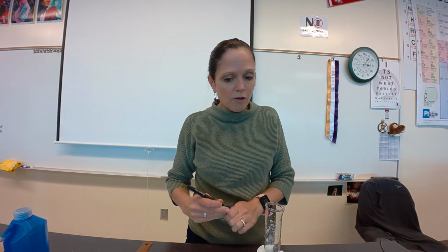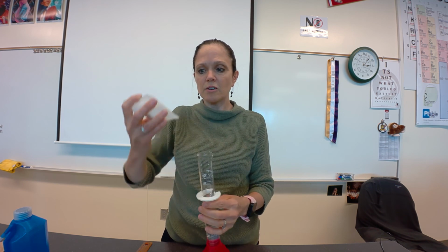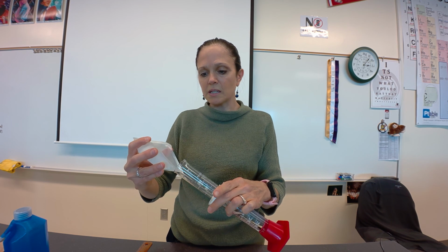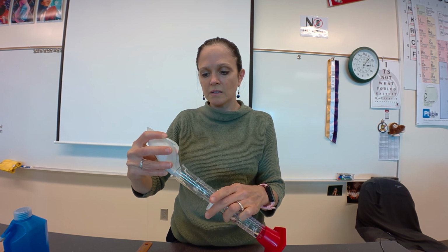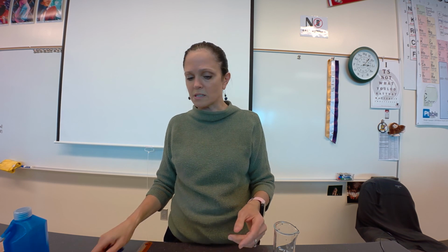Now what I need to do is I need to put this shot in the graduated cylinder, but I don't want to just dump it in because sometimes this metal is really heavy and I don't want this to fall through the water and crack the glass. So what I'm going to do is I'm going to tip this and I'm going to gently put this shot in here so I'm not cracking the glass. And I don't really want to splash either because I want the water to be at the bottom.